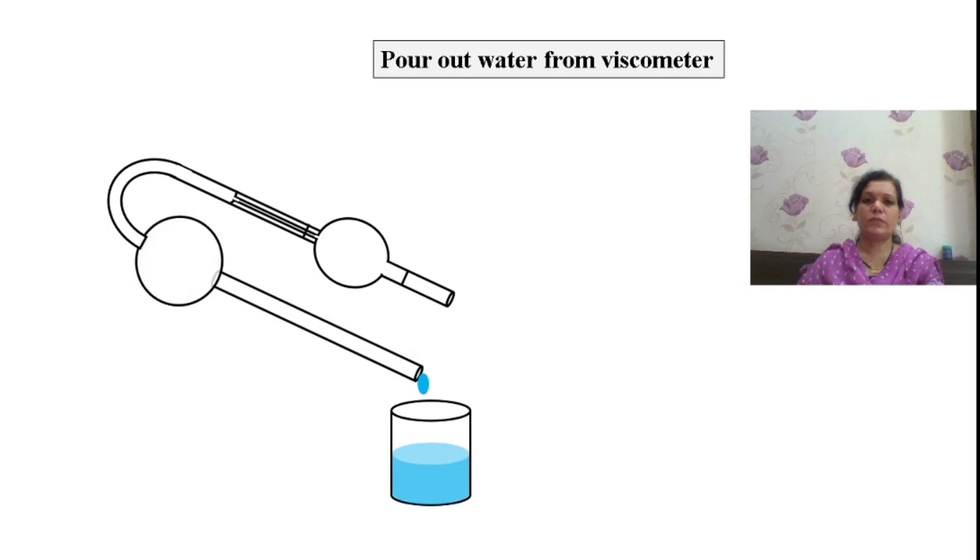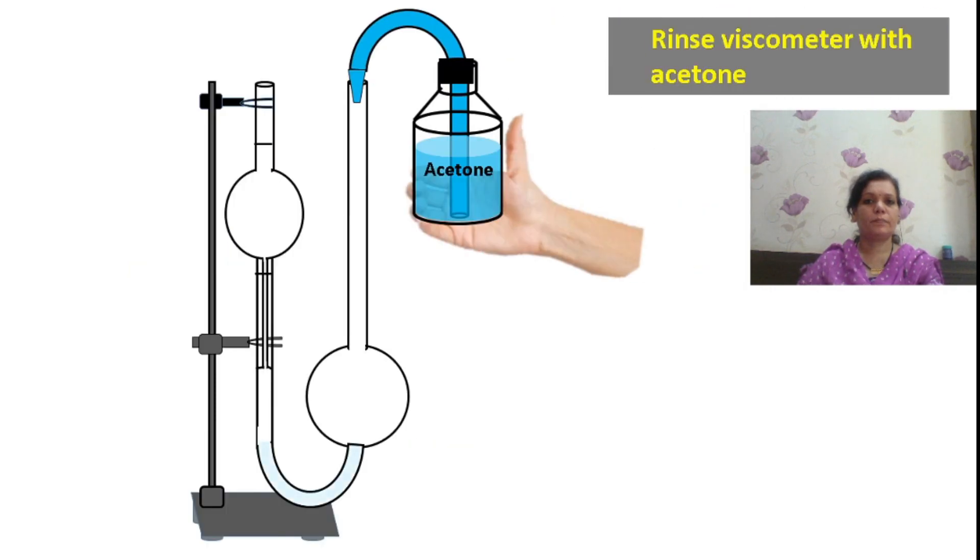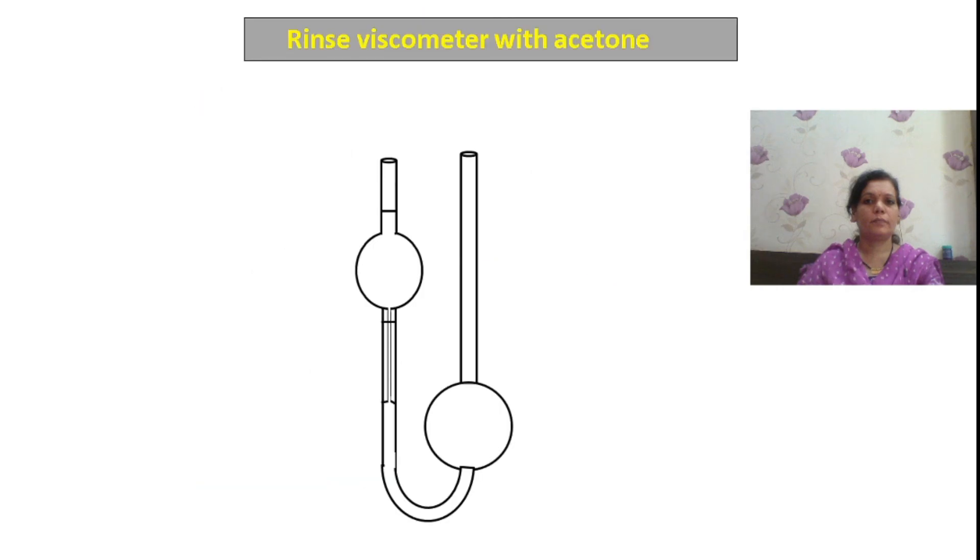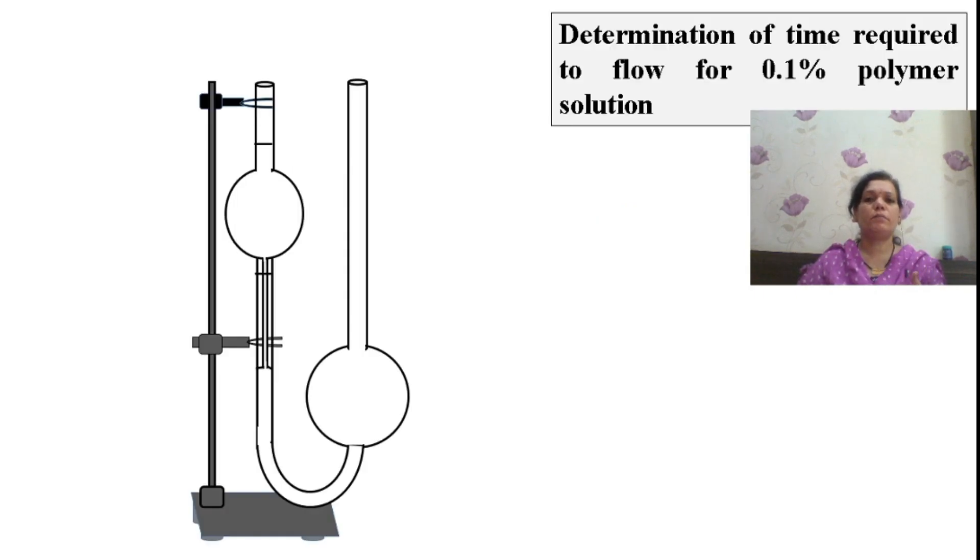Remove the water from the viscometer, rinse with acetone and dry with hair dryer. You have to repeat this procedure after every utilization of solution, after every measurement of time of flow.